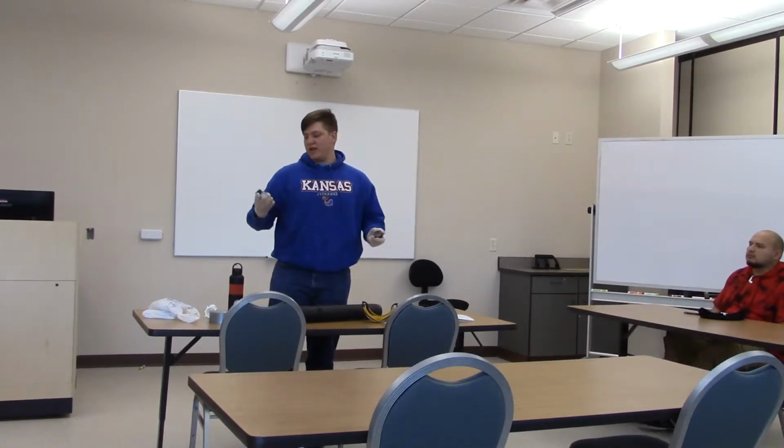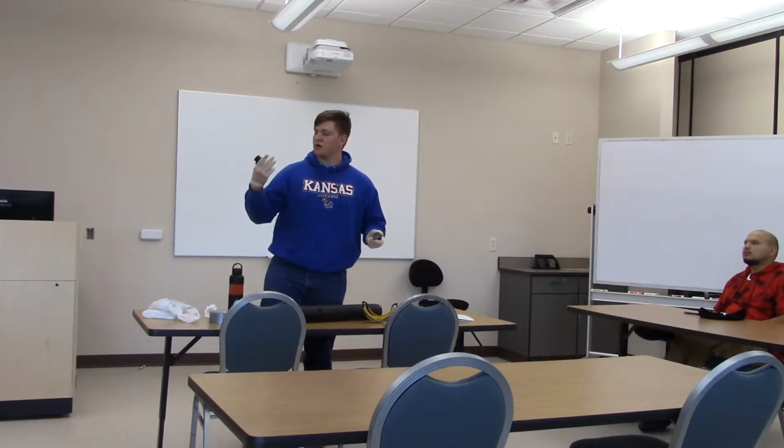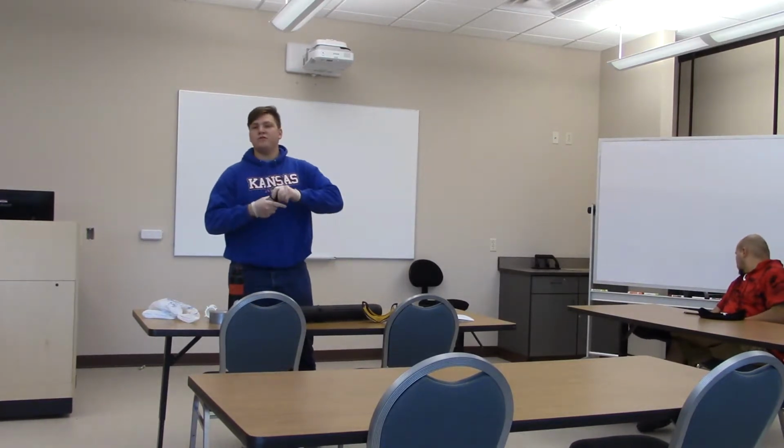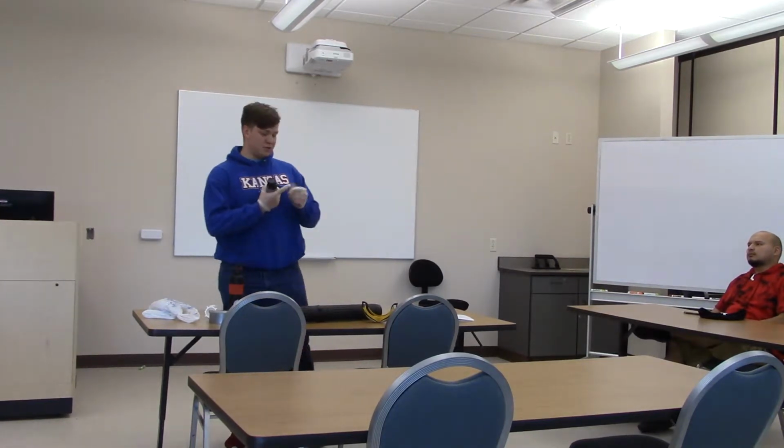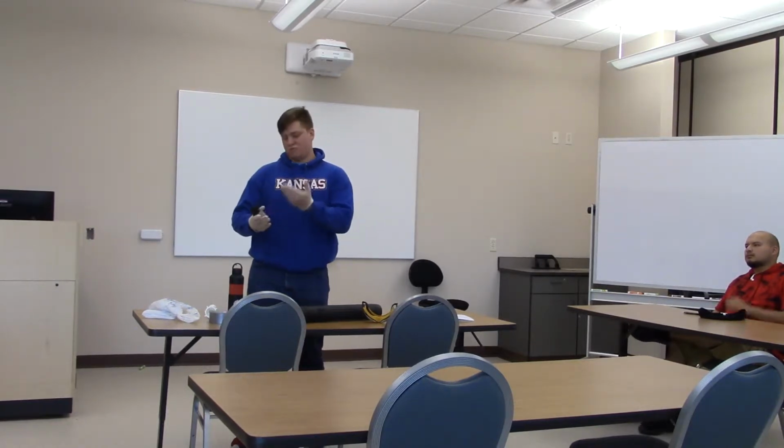So, say you find a bottle just like this, unmarked, no label, right? What do we do first? Don't touch it. That's pretty good. Get your gloves. Don't touch it with your skin. Your gloves are going to be the barrier between you and the chemicals.